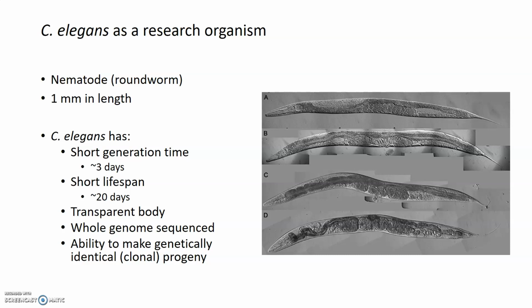And that means that the population of worms, if you chose one single parent to put on that plate, would all be genetically identical. And so you can create a very large sample size and also sort of remove the effects of any genetic background differences between animals. So we can sort of take away the genetic contributors to aging by looking at a single population of worms from one parent, and then actually start to study how the environment can really affect aging.